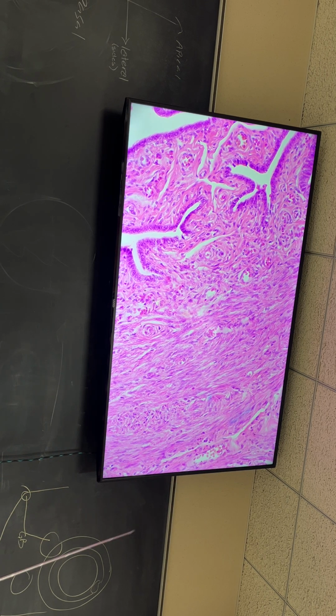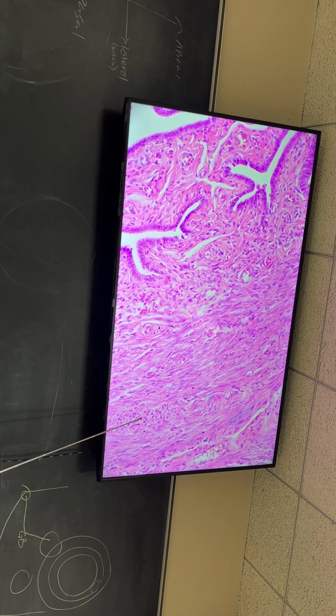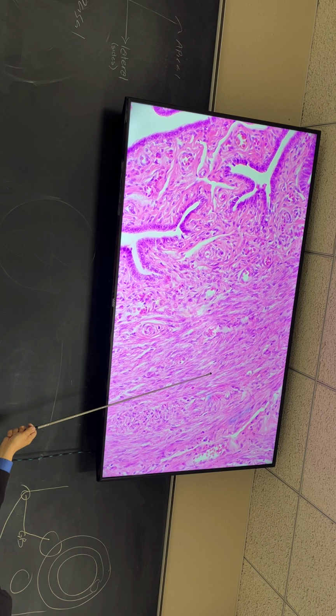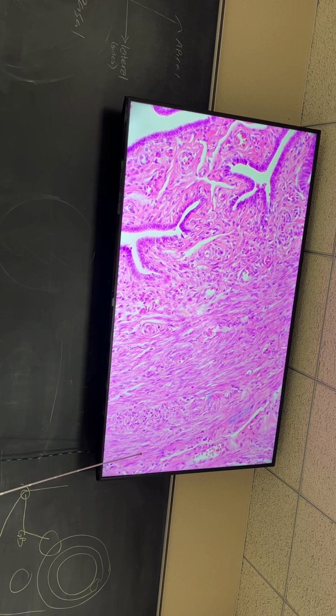At this point, it should be an easy job to see a crosscut smooth muscle, right? This is crosscut, easy to see, right? No? There it is, up there it's harder. Real good here, right? Less so up here, but still crosscut. This is the really good section. This is longitudinal here, right? You're cutting it along the fibers. To the right of it, it looks like it's longitudinal again. Yep, it looks longitudinal there almost, doesn't it?